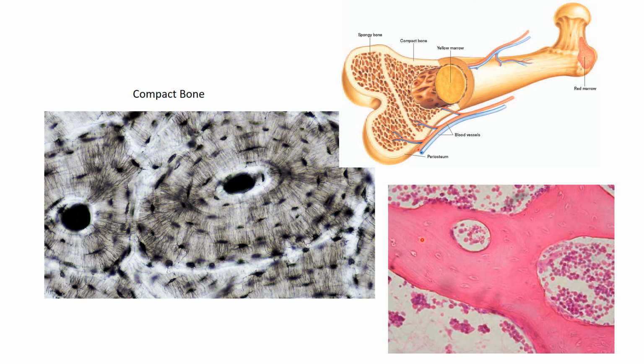I will not ask you to identify spongy bone, okay? In my quiz, I will not ask you to identify this type of bone. I just wanted to give you a comparison of spongy versus compact bone.